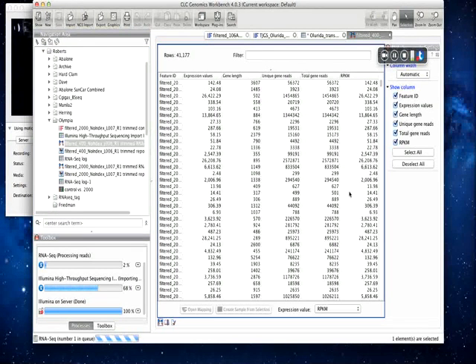Okay, for the sake of just getting done with this and posting this video, this is what it would look like. This happens to be another RNA-seq data set, but same species. But the point being, you get a table that looks just like this, and when we're talking about DE-seq and these other programs, you would feed it in with these read counts, and we can discuss the value of doing unique versus total. But from my experience, you're going to get about the same, and as you see here, they're quite similar.